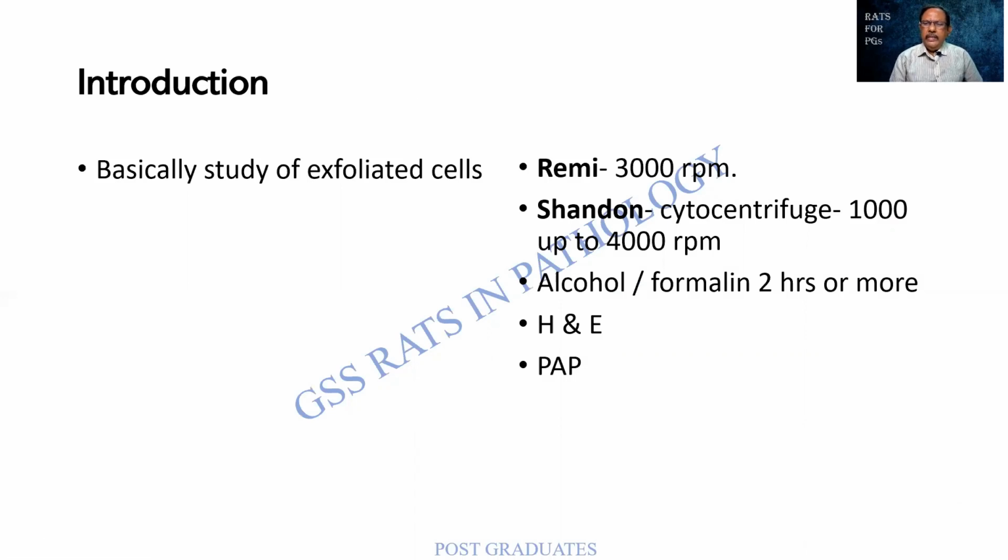In the first class, we have dealt with liquid-based cytology, in which the material is collected, it is suspended and studied. In this case, there is an exfoliation of cells constantly taking place from the surfaces of the body.